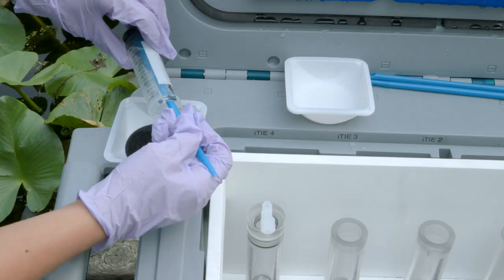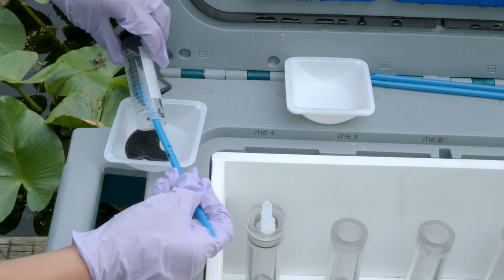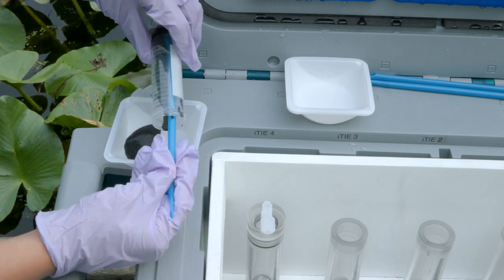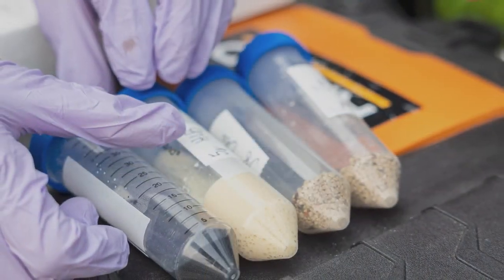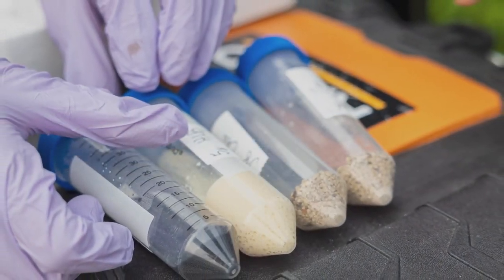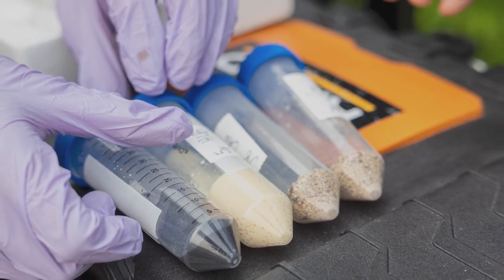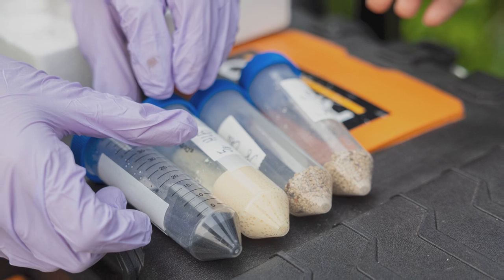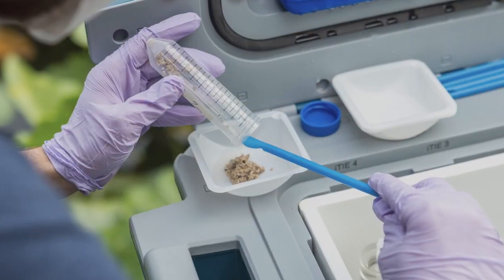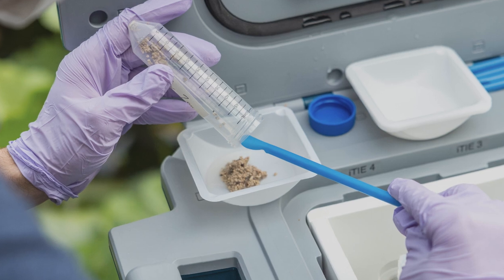Resin chambers can be loaded with different diagnostic resins, each utilizing physiochemical properties to pull specific contaminant classes out of site water. For instance, zeolite can remove ammonia, Chelex can remove heavy metals, C18 can remove nonpolar organics, and Oasis WAX can remove PFAS molecules. Users can select different resins depending on the chemicals present at each site.